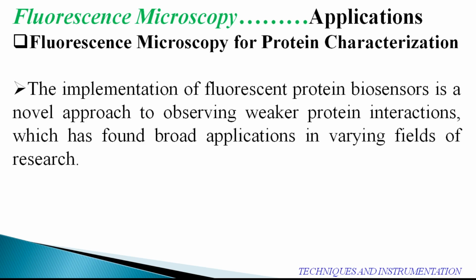So researchers have utilized the fluorescent proteins to observe intracellular reactions in the hope of gaining insight into various transmission reactions basically. By analyzing the specific wavelength emitted by the excited cell during protein synthesis, it is definitely possible to carry out understandings on protein characterization.